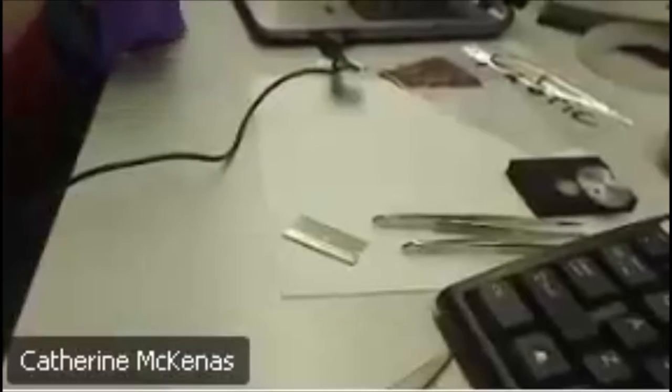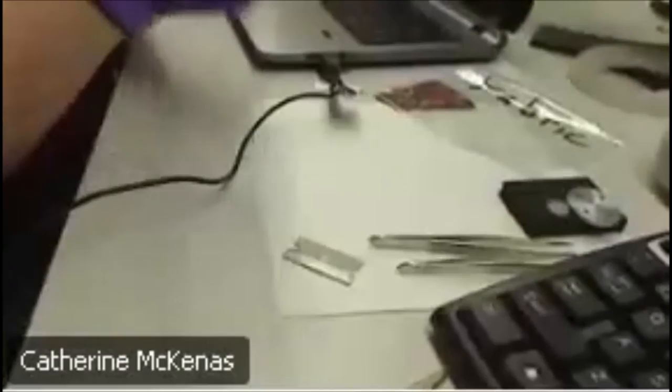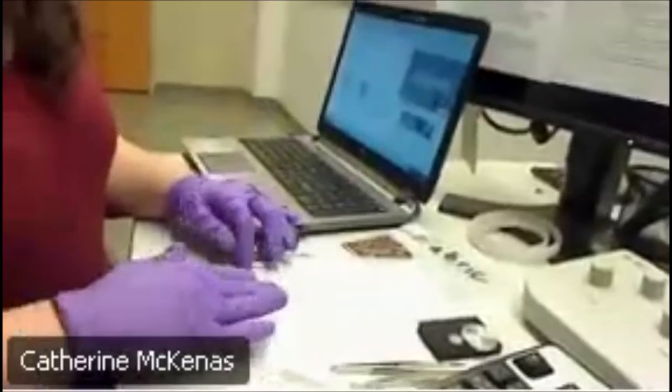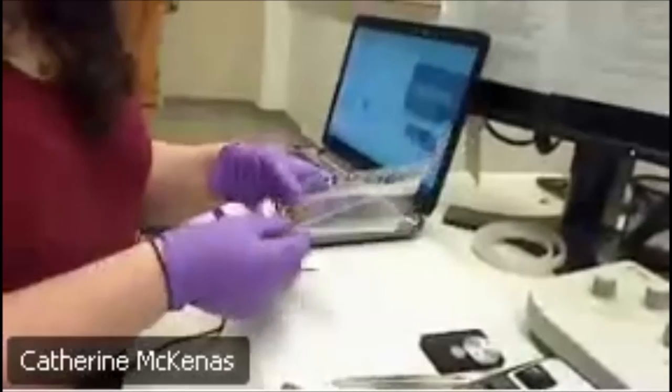All right, cool. So, first thing I'm doing is I'm putting on gloves. Anytime we've handled y'all's samples, we've always put on gloves because we don't want any residues from our fingers to get on your samples. And we've already loaded your samples into the instrument. I'll go through what samples we've loaded, but just to show y'all how this works, I'm going to show you guys right now. Are they still there?